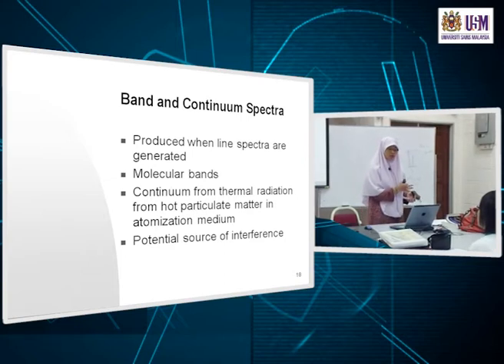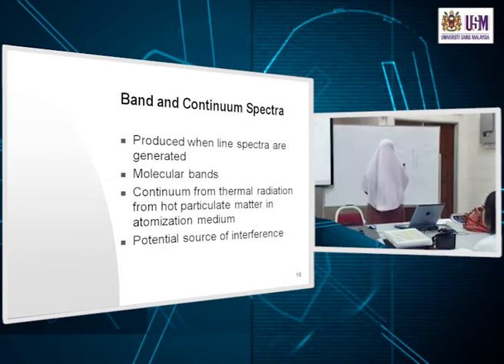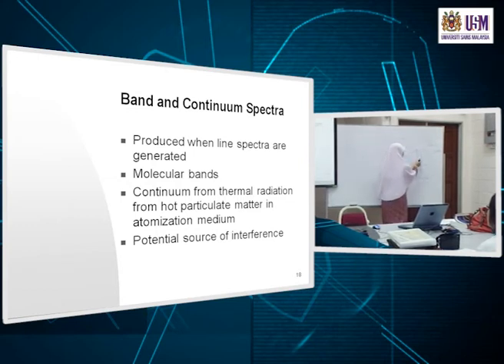So we were talking about the line widths of your atomic spectrum, whether it be atomic absorption or atomic emission. Another term that we must be familiar with, as we've mentioned before, is band and continuum spectrum.